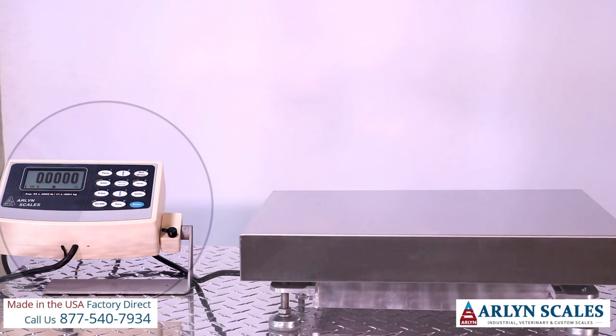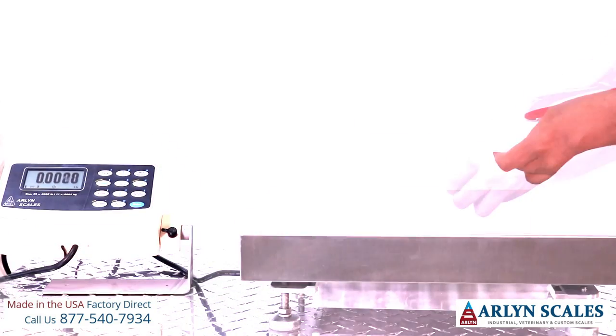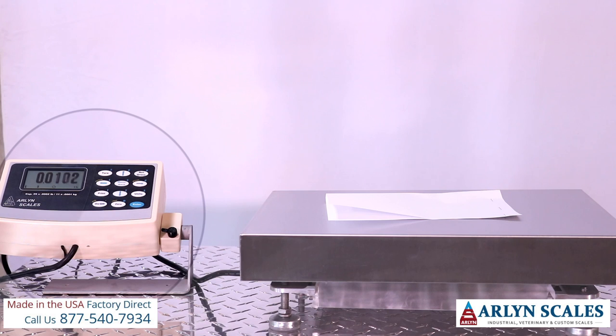Alright, let's weigh this sheet of paper. There's our reading. Now let's add a few staples. As you can see it registered the additional weight.